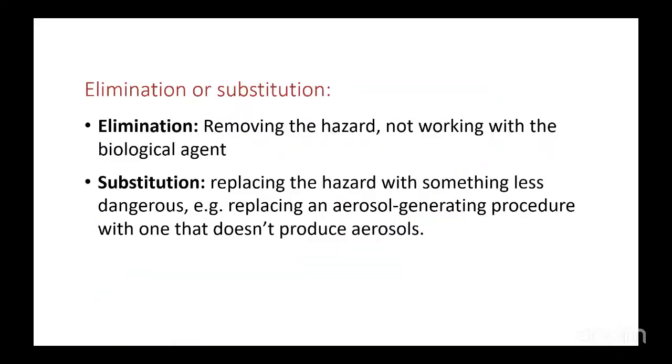Elimination means removing the hazard, not working with the biological agent. That is elimination. Substitution means replacing the hazard with something less dangerous. Example, replacing an aerosol generating procedure with one that does not produce aerosols.